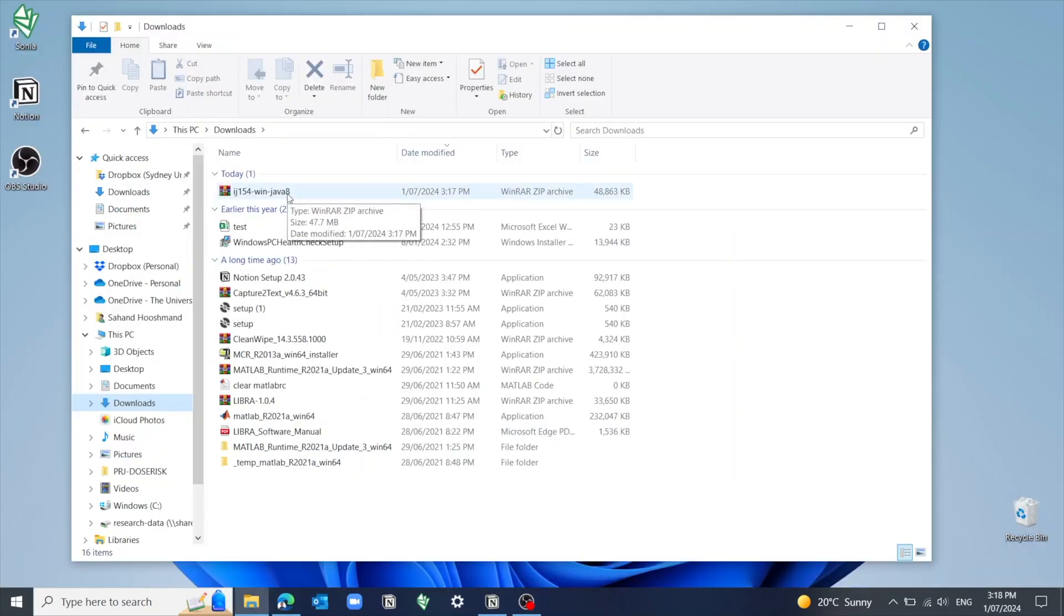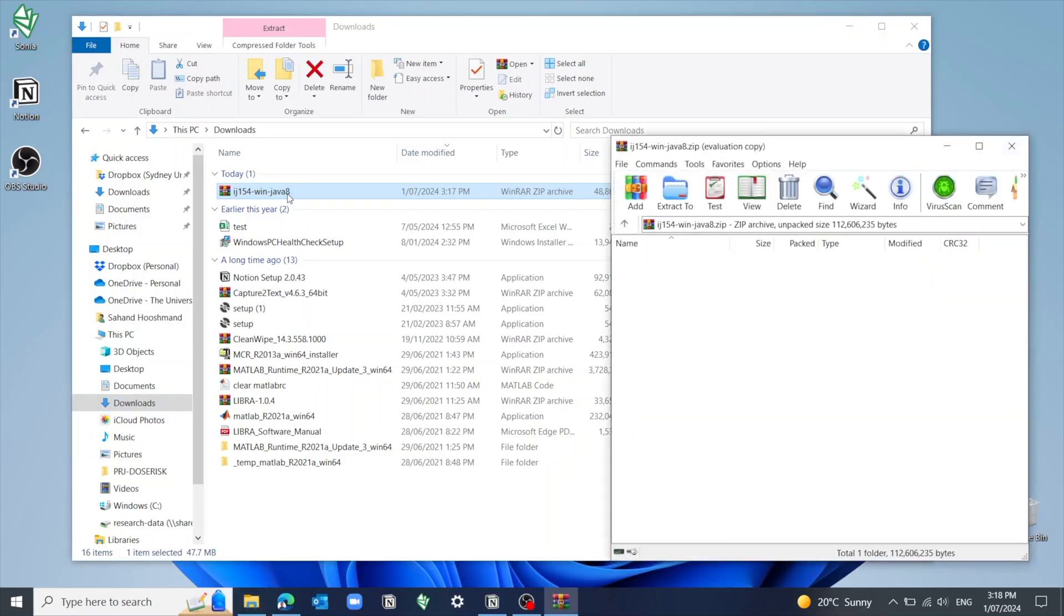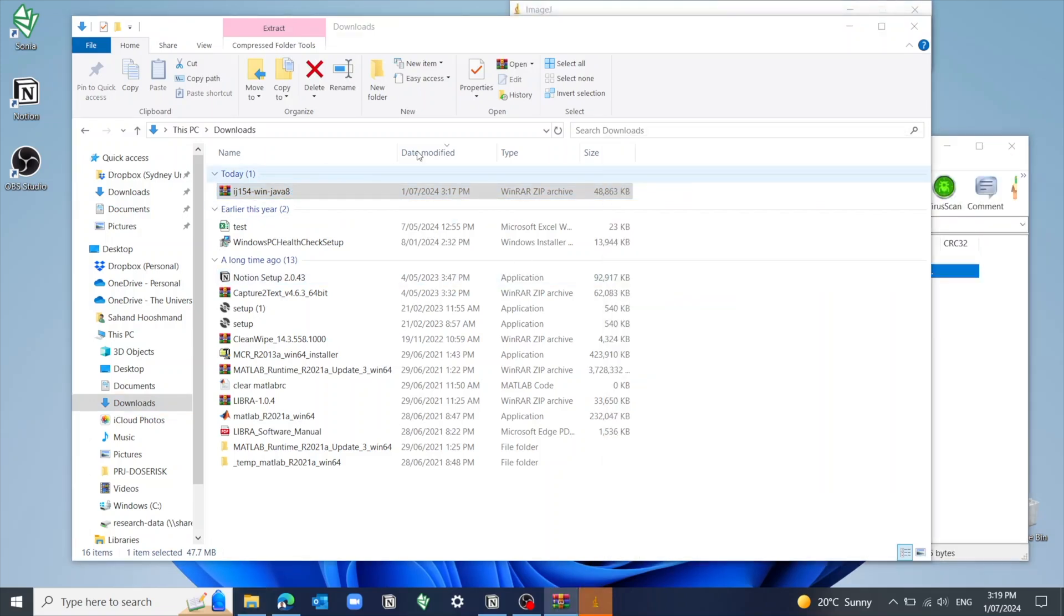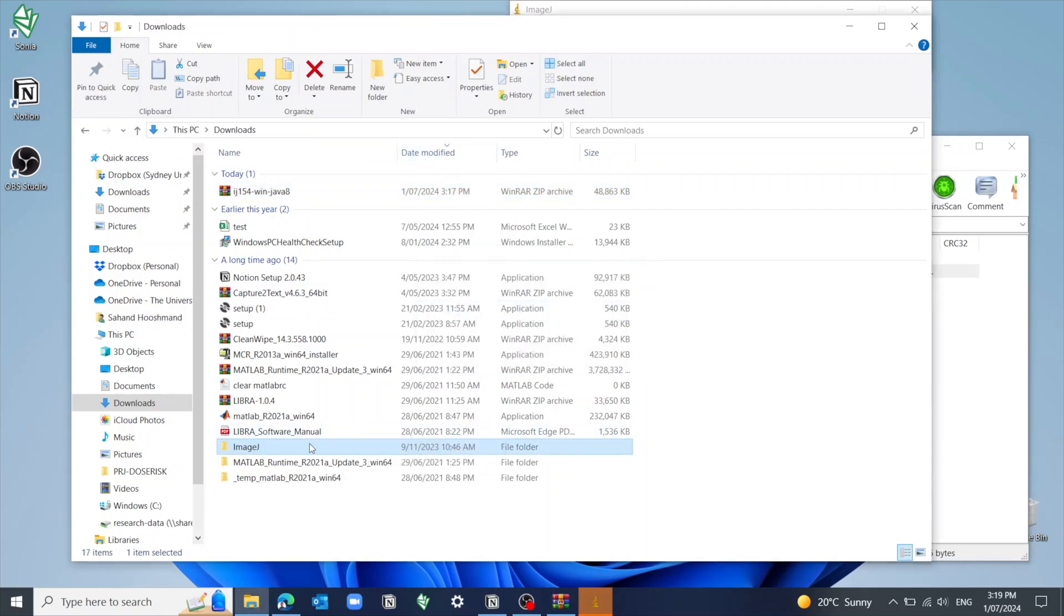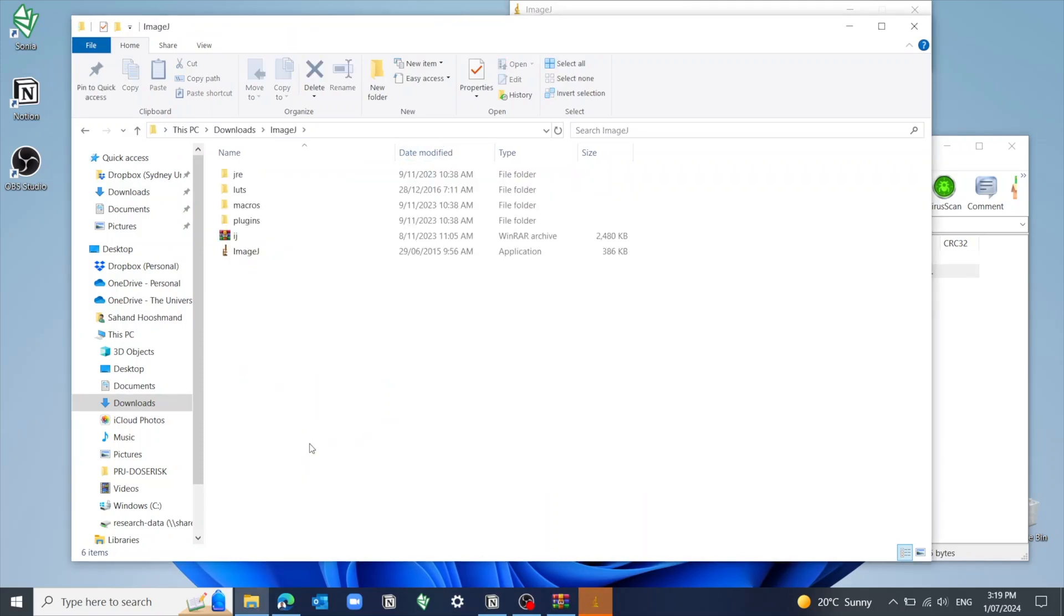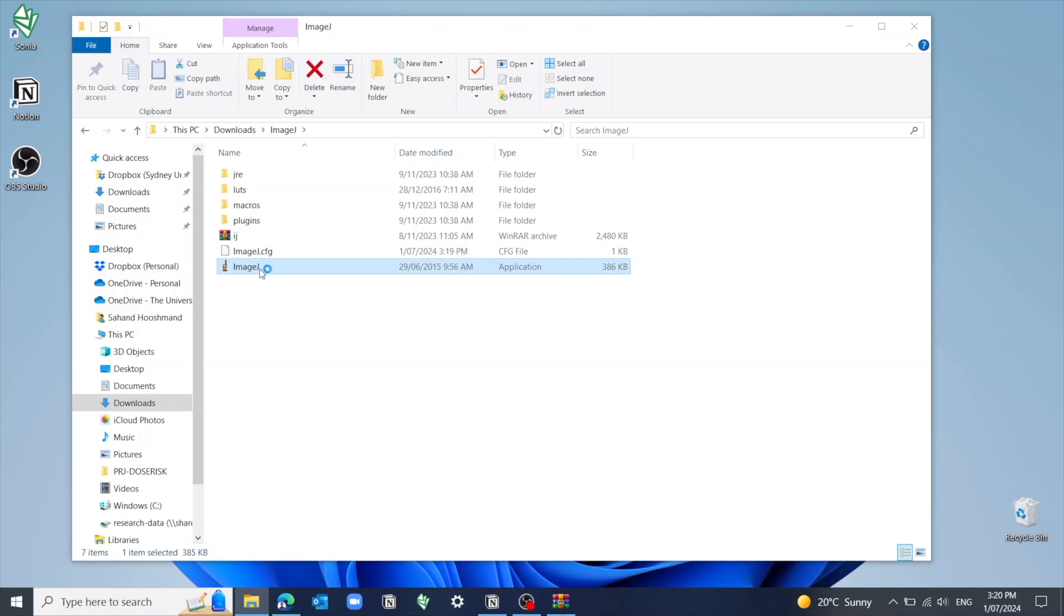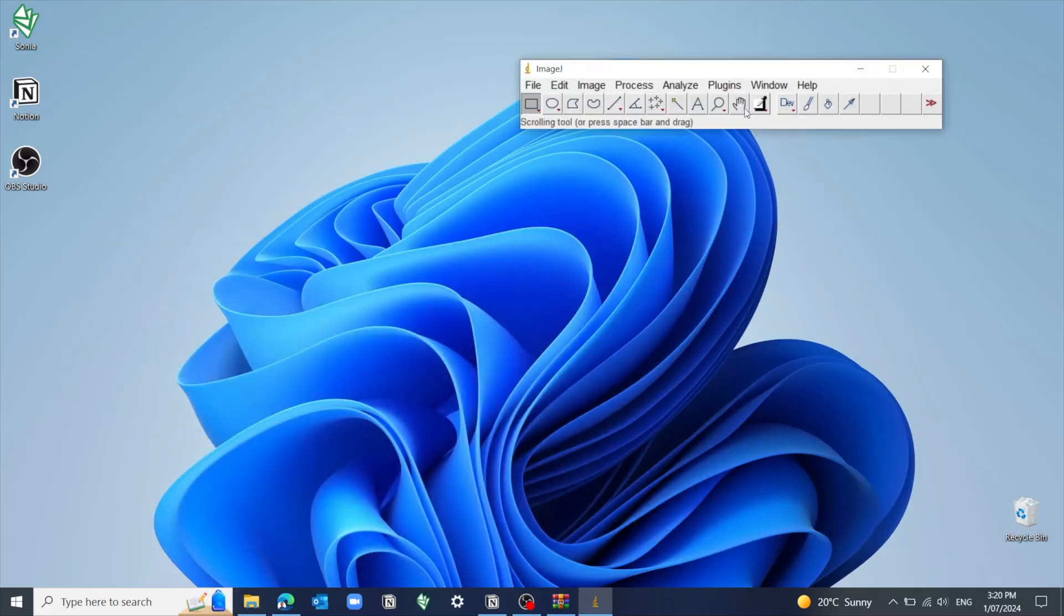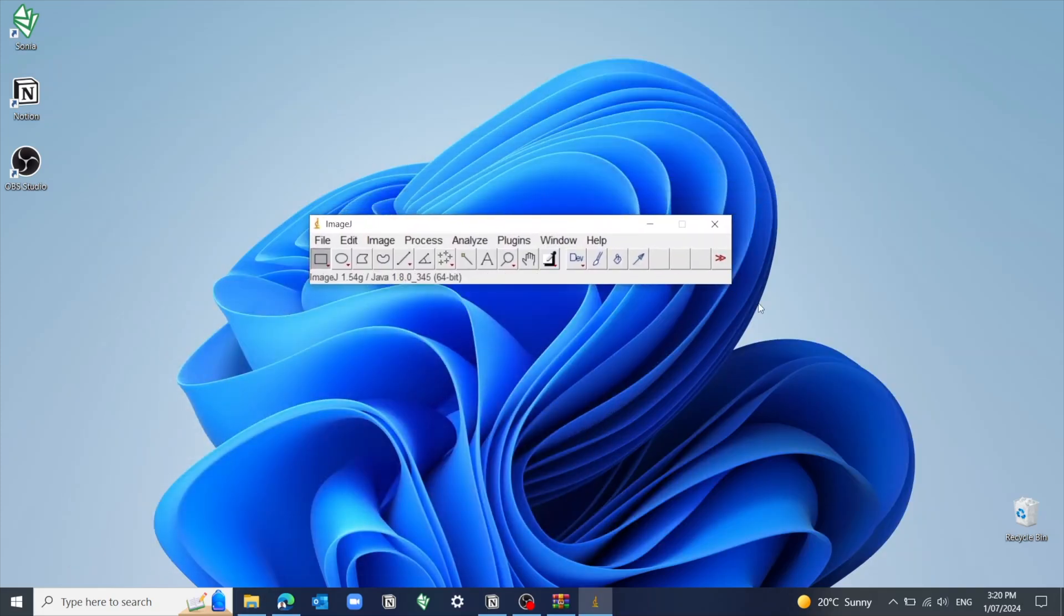And once it's done, open up the zip file and drag out this folder called ImageJ. Now you can put it anywhere, but I like to just put it in the same downloads folder for now. And once that's done, just double click on the ImageJ application icon and you should be good to go. Now I know sometimes it's a bit different on Windows where it asks you to extract some files to a certain location. So if that's the case, just export it somewhere and ultimately look for the exe file and double click to open it.